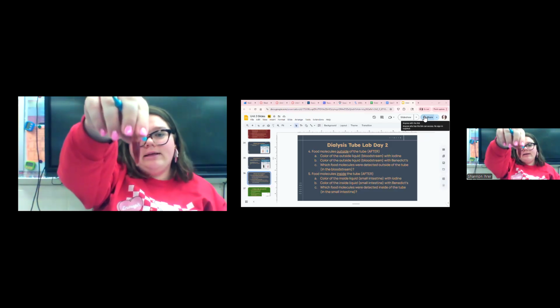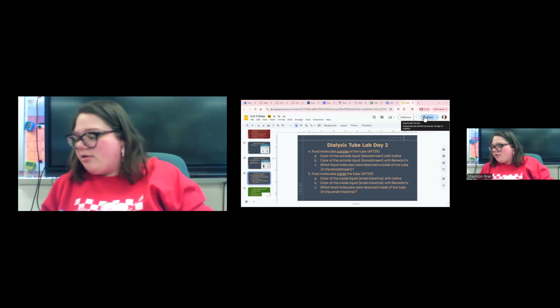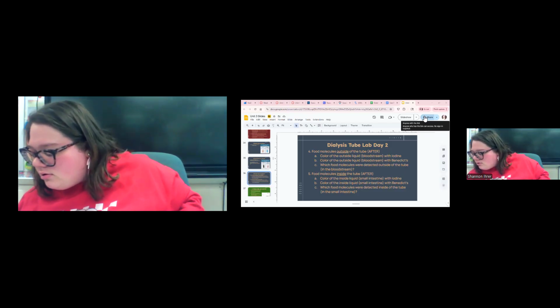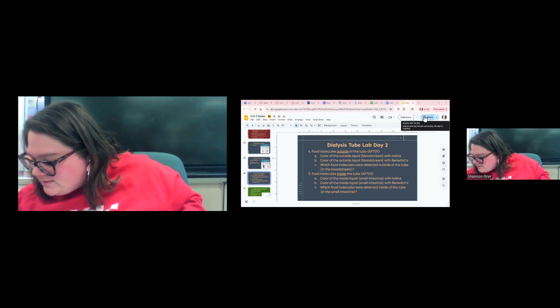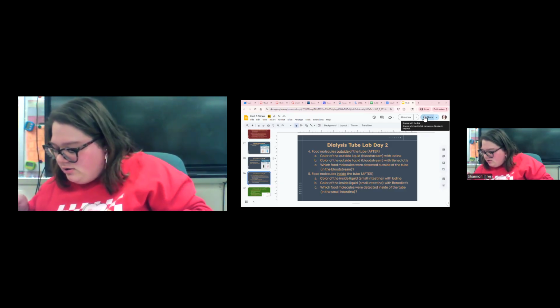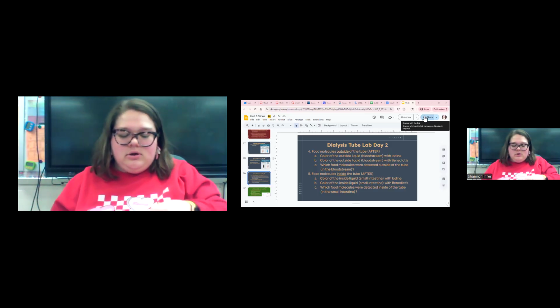You could write light brown, reddish brown, but it's still a brown color. Now, I didn't give this the full time to process, so I'll show you a color comparison here.